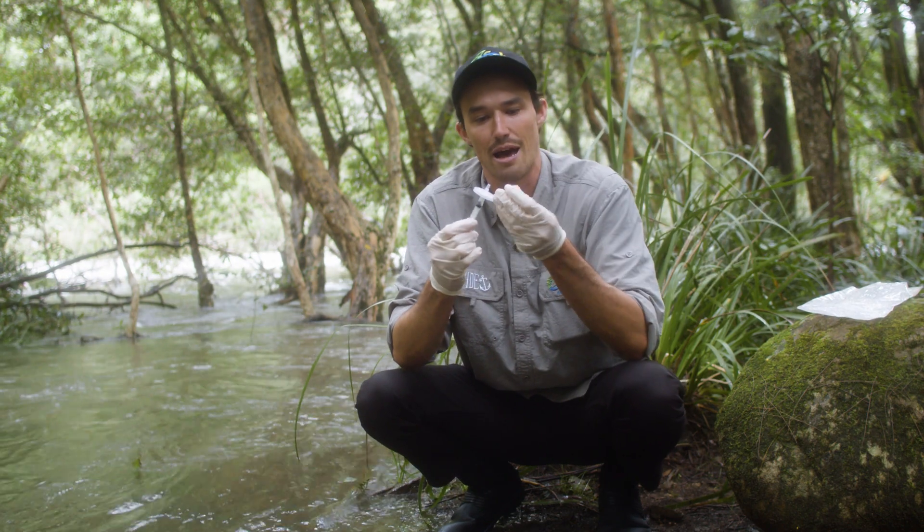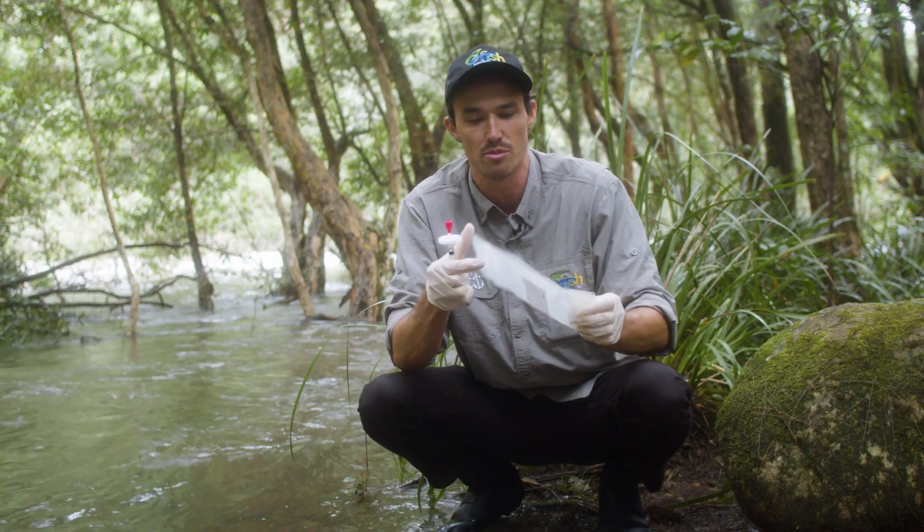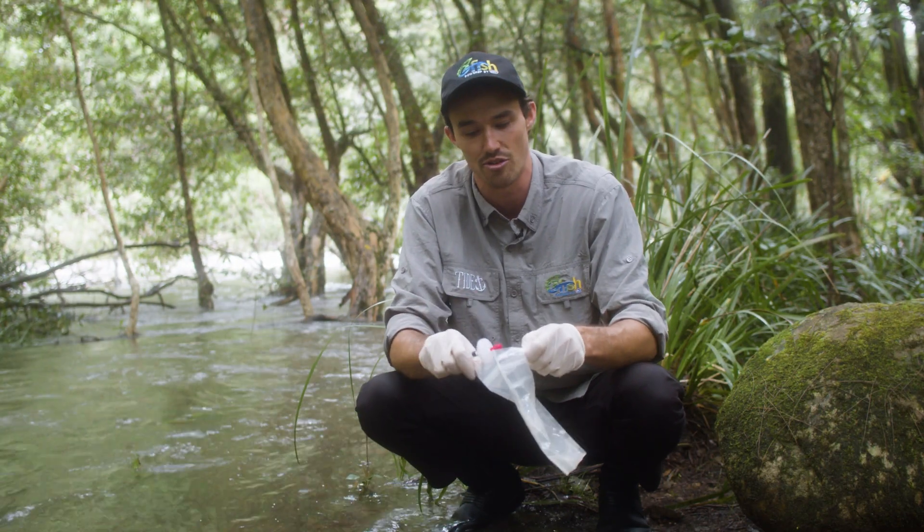Then we just want to put the cap back on the end and leave this all as one piece — that's going to go into the sample bag, which can be sent directly back to the laboratory.